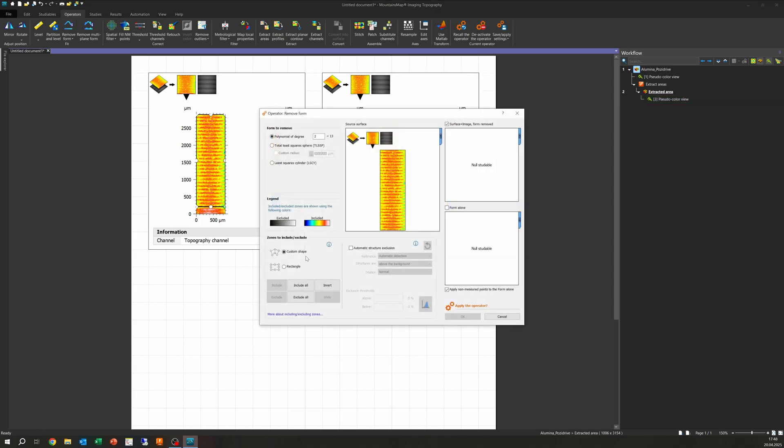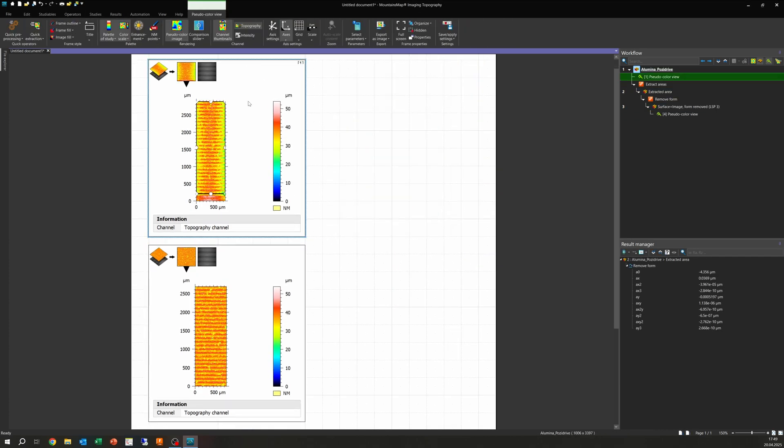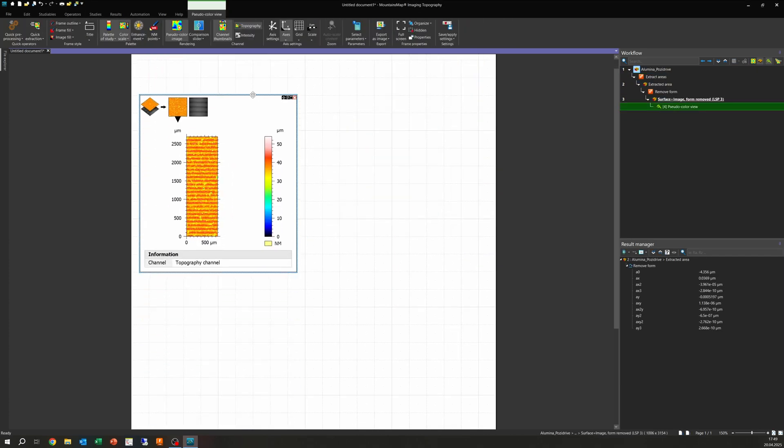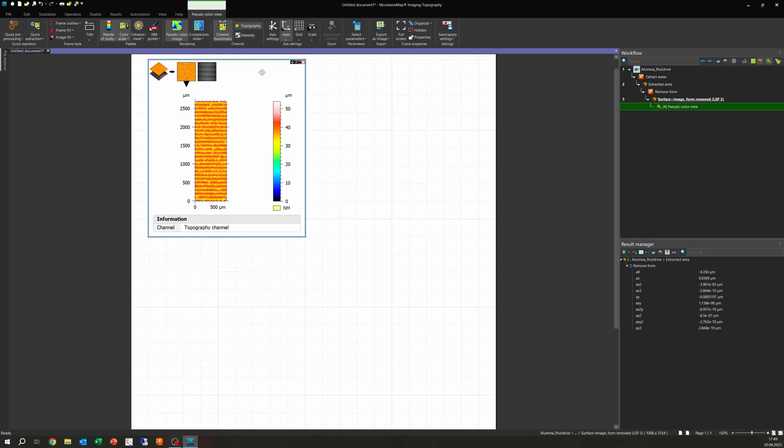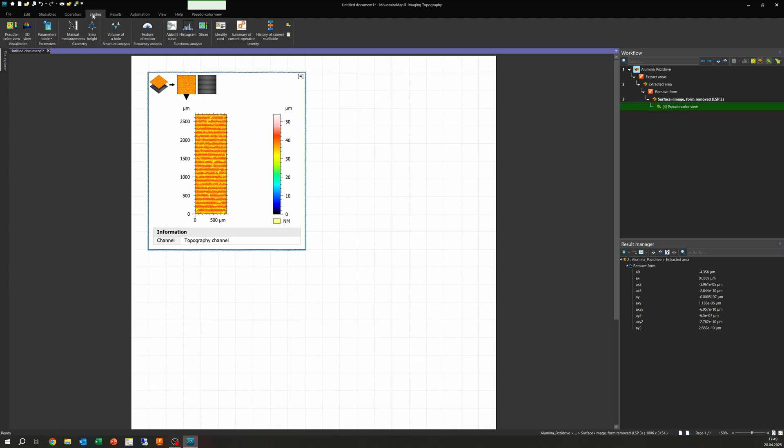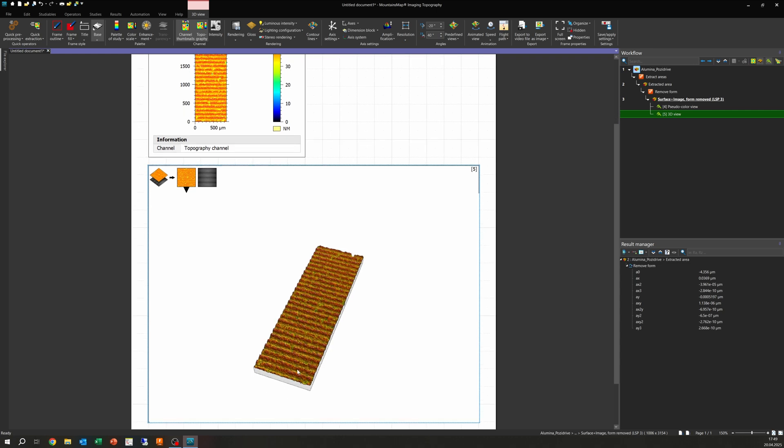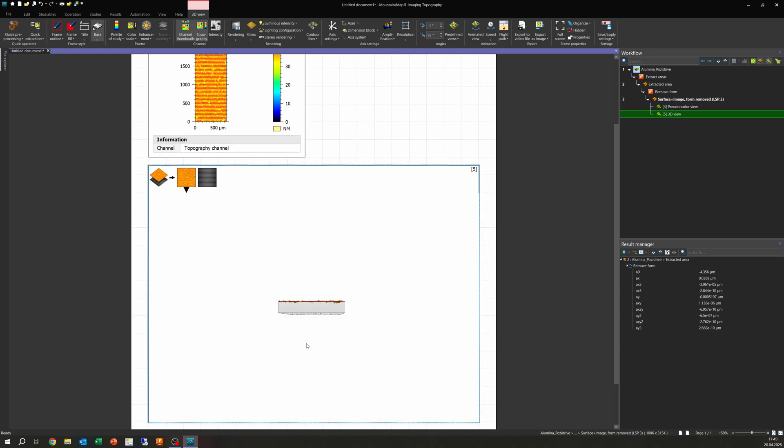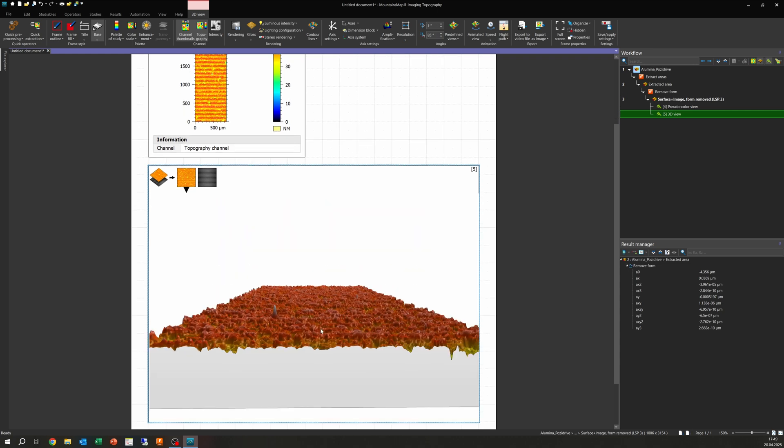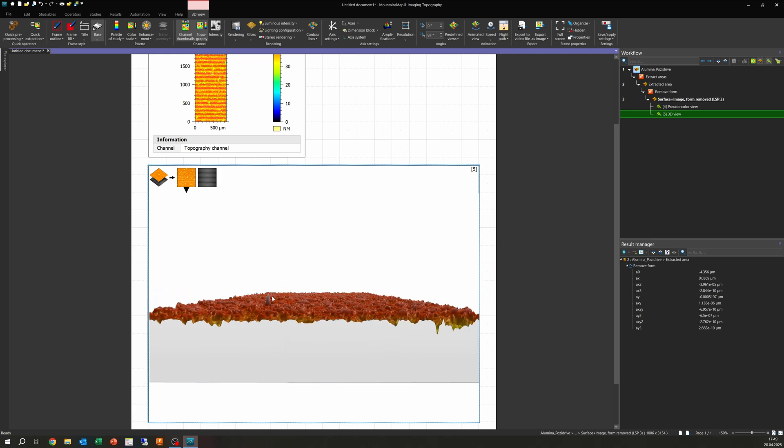For this, we first need to remove the shape of the part, called form. A form removal operator uses a third degree polynomial. By this, the curvature is calculated and all points are adjusted in their height by this deviation from the mean plane. The result is the same data set, just very flat. It's a low degree polynomial because at this point, we just want to remove the shape deviation, not filter any roughness.